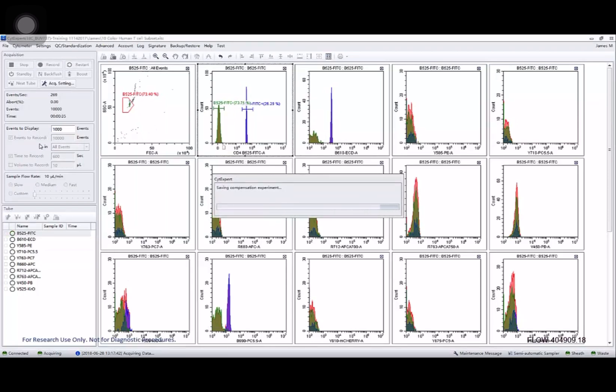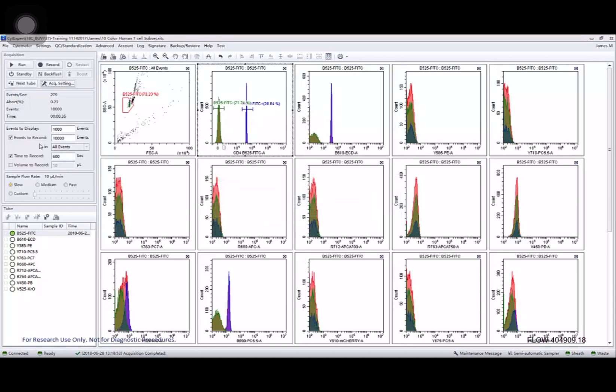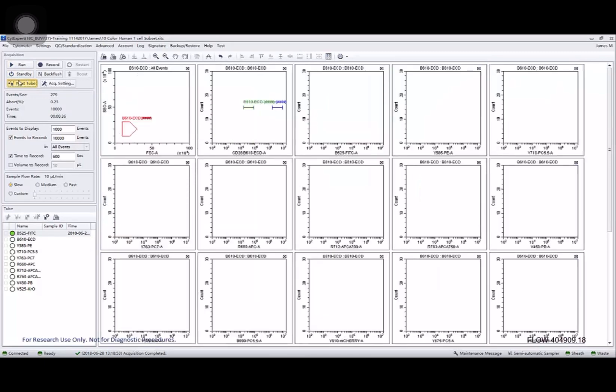After it's finished recording that is saved as part of the compensation experiment. And then I'll just move on to the next sample.